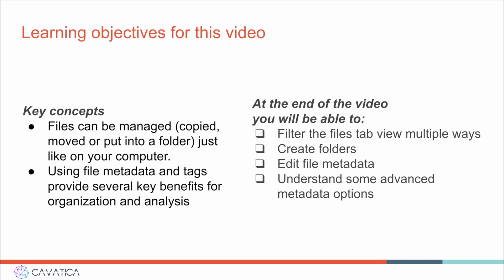Please keep in mind a few key concepts. The first of which is that you can manage your files, such as copying, moving, or putting into different folders and subfolders, just like on your computer, regardless of whether or not they are hosted in the project itself or symbolically linked. Second, using file metadata and tags provides several key benefits for organization and downstream analysis.